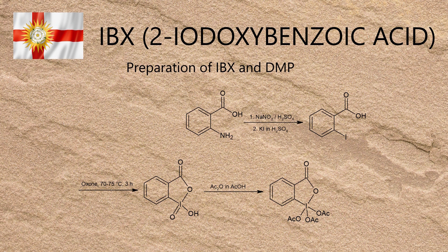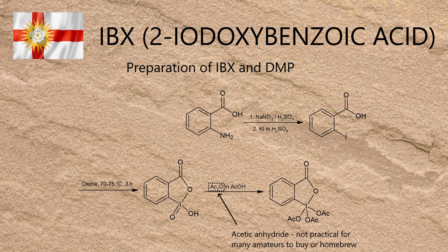For various reasons, both IBX and Dess-Martin periodinane are shockingly expensive to buy. However, the synthesis of IBX is relatively easy and amateur accessible, and that's what I'll be demonstrating in this video. Preparing Dess-Martin periodinane itself needs a whole load of acetic anhydride, which I can't buy and is a pain to make. Despite the big difference in solubility, Dess-Martin periodinane and IBX are for the most part functionally identical.